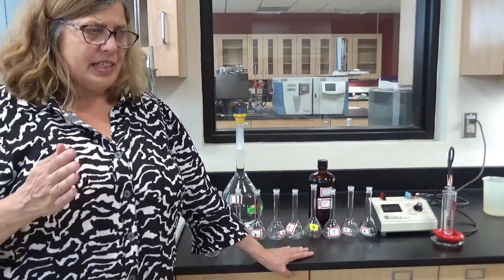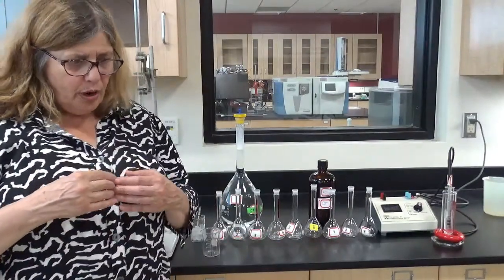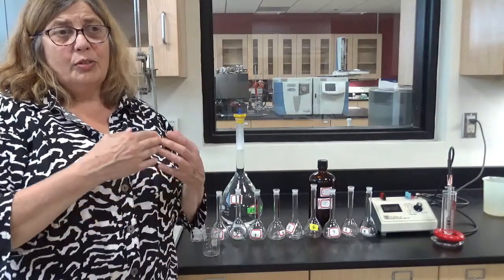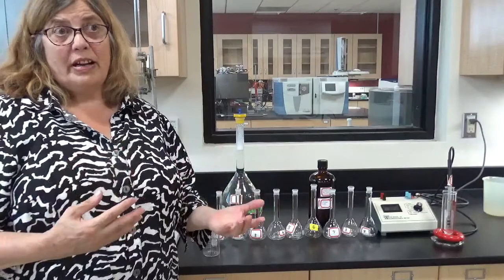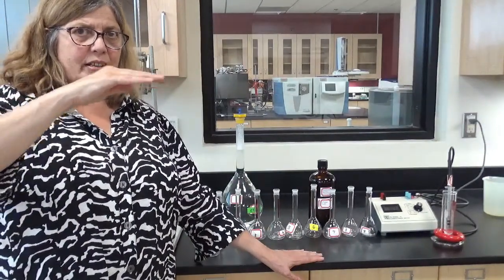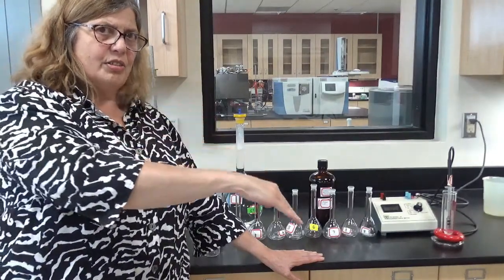So what happens is, as the number of micelles builds up, you have more and more phenanthridines that are going inside these micelles, and the ones that go inside don't fluoresce. Their fluorescence is quenched. And so what we see is that as you get to the critical micelle concentration, here's the fluorescence intensity. When you get to the CMC, it starts to drop.